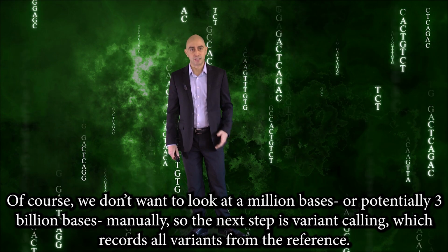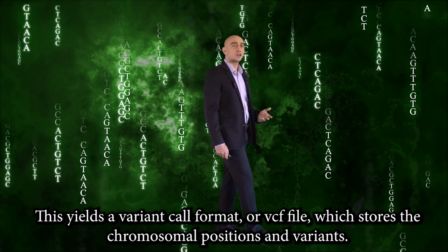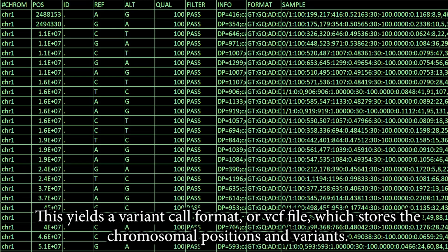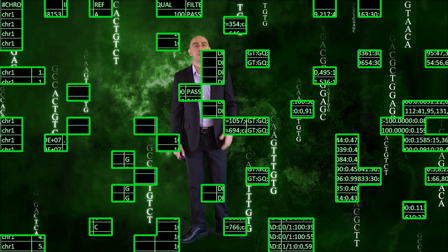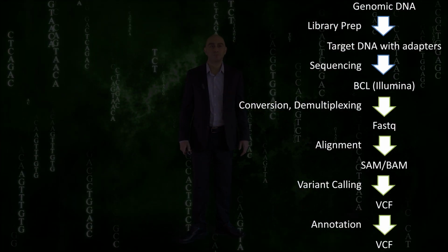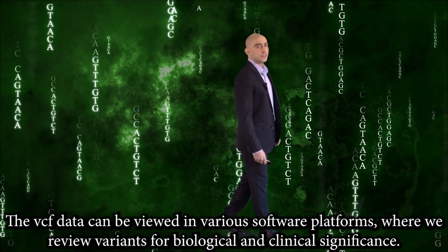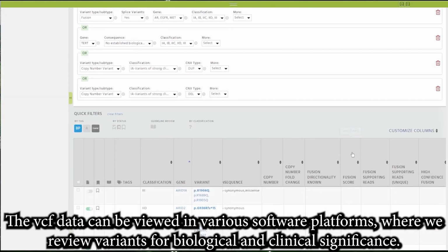step is variant calling, which records all variants from the reference. This yields a variant call format, or VCF file, which stores the chromosomal positions and variants. This file can undergo annotation, where we add things like gene name, amino acid change, and population frequencies. Here's a summary of the steps from sequencing to annotation. The VCF data can be viewed in various software platforms where we review variants for biological and clinical significance.